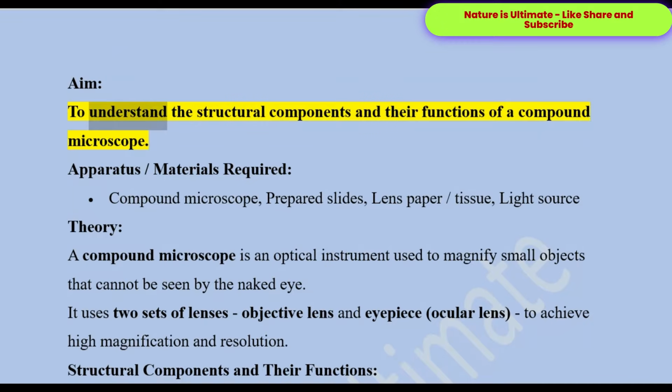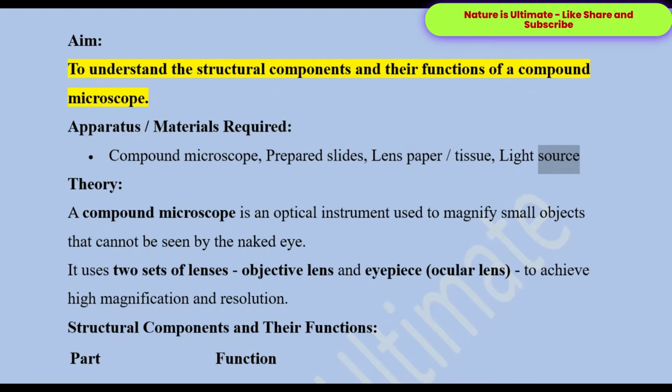Aim: To understand the structural components and their functions of a compound microscope. Apparatus/materials required: Compound microscope, prepared slides, lens paper/tissue, light source.